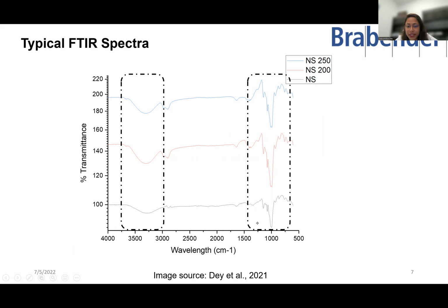One thing that we see here is that in case of starches, usually between 900 to 1200 wave number is the fingerprint region of starches. Fingerprint region meaning that we definitely see some differences of what exactly is happening in this particular compound. So here, if we look at it, definitely we see some changes compared to this, and another sample that was extruded compared to the raw material. Now, these are again the process-induced changes.